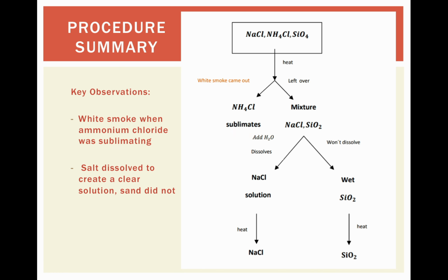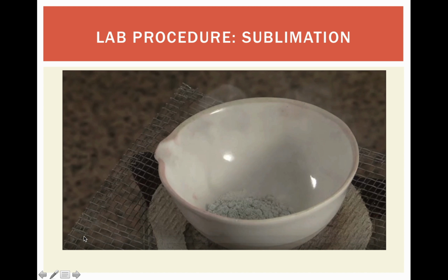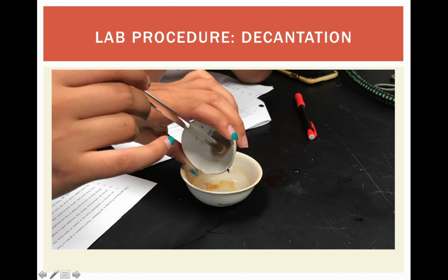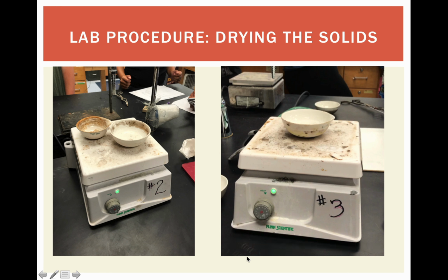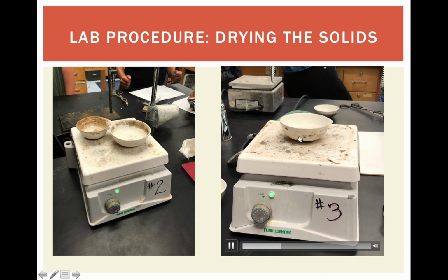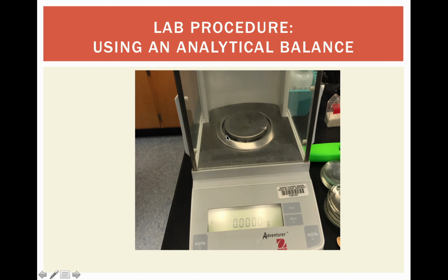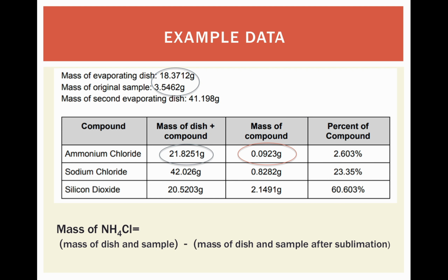So here's some highlights of what we did. We sublimated, we decanted, as you can see here. We heated up our solutions in order to dry them, getting all the water to evaporate off. And we learned how to use an analytical balance, which has these doors to protect it from the wind or air flow in the room messing up our measurements.